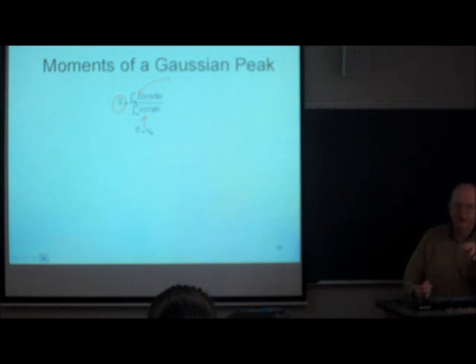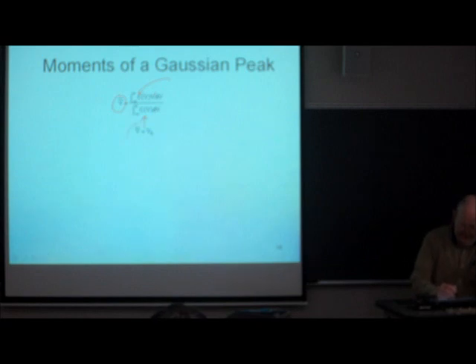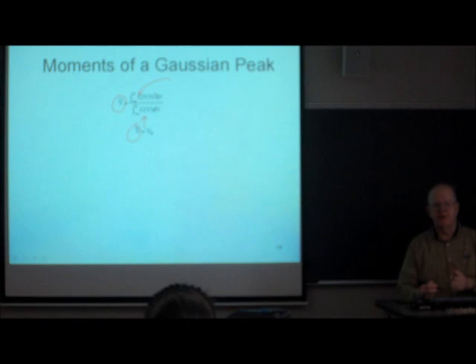If I put in the equation of a Gaussian peak, this V bar is equal to VR, the retention volume of the Gaussian peak. If I looked at this as a function of time, and I put in the Gaussian as a function of time, and did the integration as a function of time, this would be the retention time of the peak.